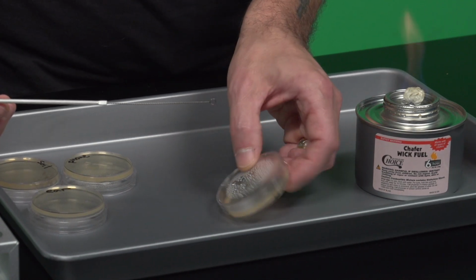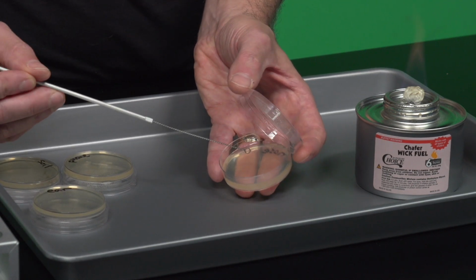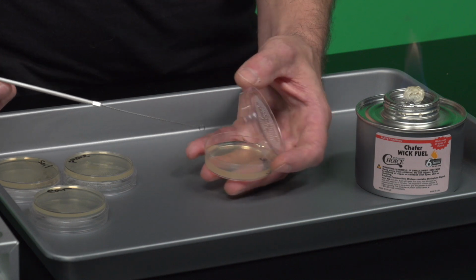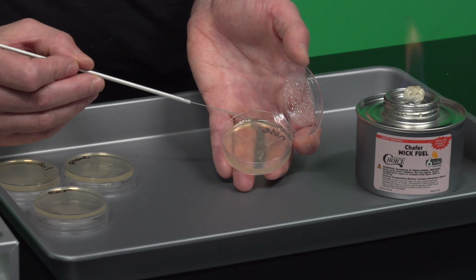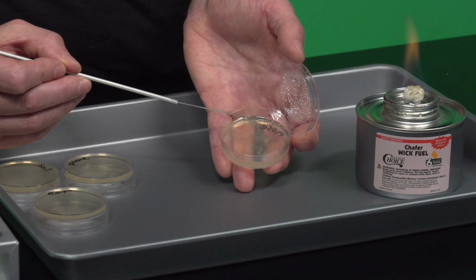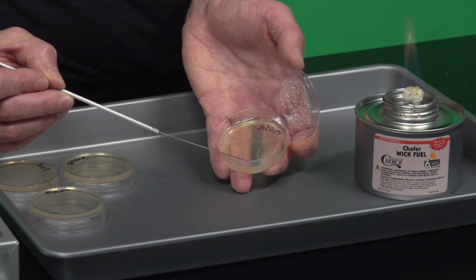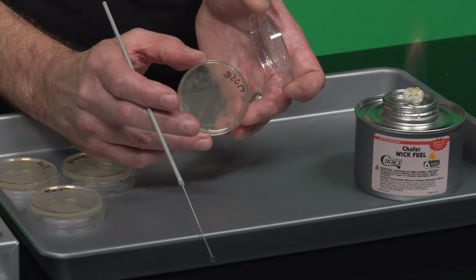So again, just like before, you can do it one of two ways. You can hold it right side up like this and work like this, where you're using the lid as a barrier. I'll do that a couple times, and then I'll do it the other way. The key thing is to take it from quadrant 1, just like we showed on the board, and bring it out into quadrant 2, back into quadrant 1, out into quadrant 2, and then I'm not going to go back into quadrant 1, I'm going to stay in quadrant 2, and there we go.